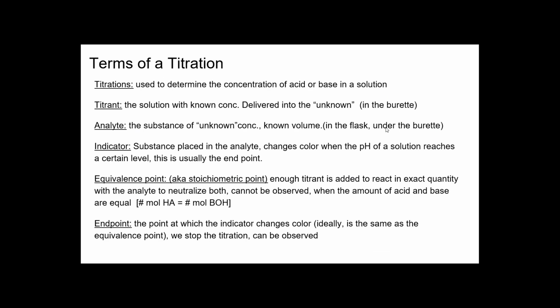Here are some terms I put together for you. Titration is used to determine the concentration of an acid or a base in a solution by using another solution of known concentration and volume. Titrant, the solution with known concentration delivered into the unknown. In this case, it's in the burette, and it's sodium hydroxide. Analyte, the substance of an unknown concentration, but you will know the volume. It's in the flask and is below the burette. It's where the titrant is being dispensed into.